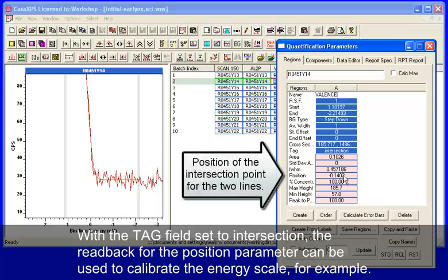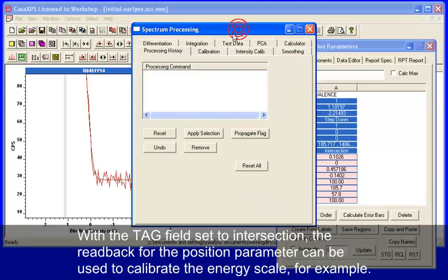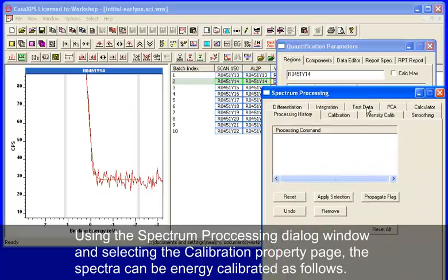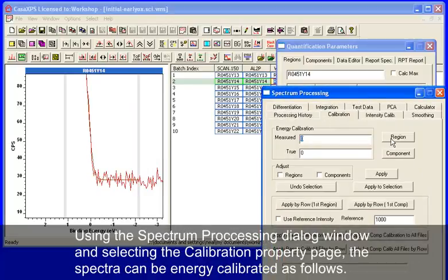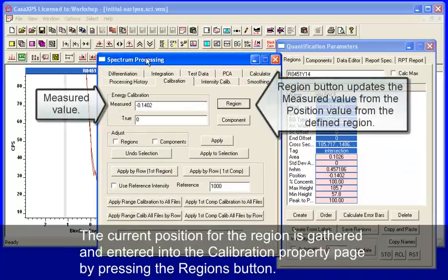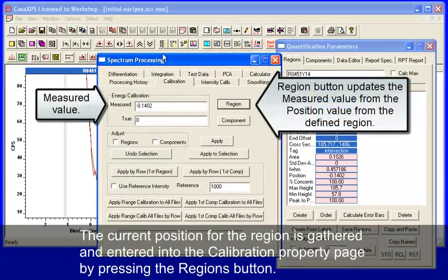To do that, what we need to do is use the calibration property page, press the button that says region, and that brings in from the selected region the position for that region.